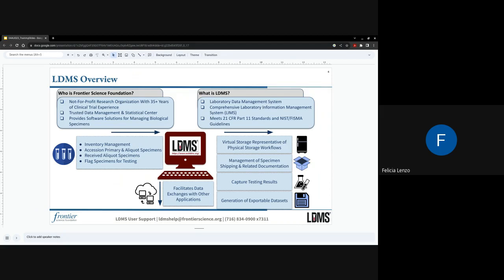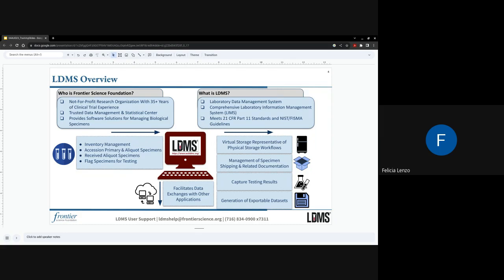The second half of the screen shows a workflow of how data comes in and out of LDMS. LDMS will act as your inventory management system, allowing you to accession primary and aliquot specimens, receive aliquot specimens from sending labs, and flag specimens for shipping and testing. It will also act as virtual storage, representative of your physical storage workflows, allowing you to create different storage structures. LDMS also helps manage specimen shipping and curate related documentation that will accompany each shipment.